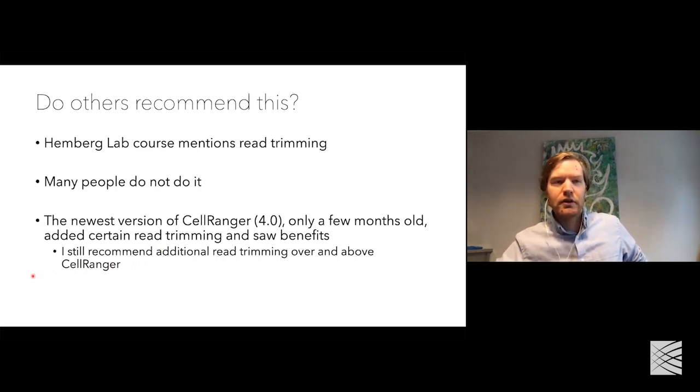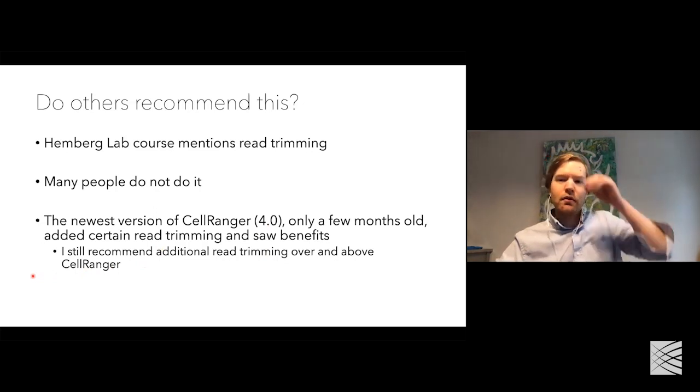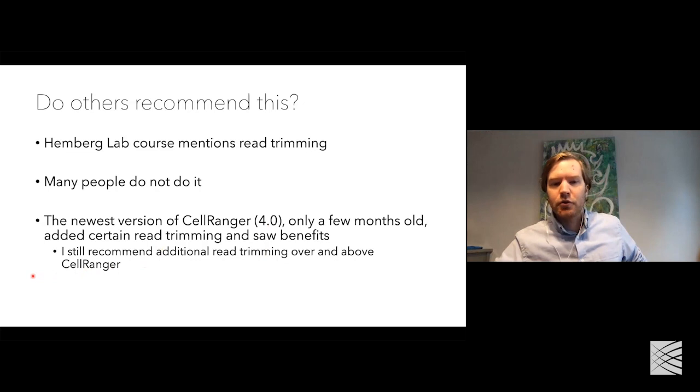But take a look at your data, look in IGV, see if things are piling up on a stretch of homopolymers in a way that looks like it's just implausible and probably a technical artifact.